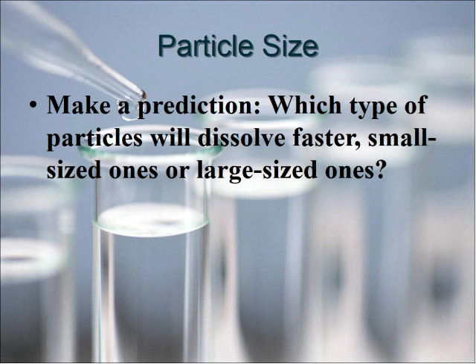We're going to look at 3 different ones, and for the people at home, you're more than welcome to go to your lab kit and pull out your sodium chloride. Three different ones came in your little lab sheet. We've got the fine salt. It's the best looking salt. It's fine.